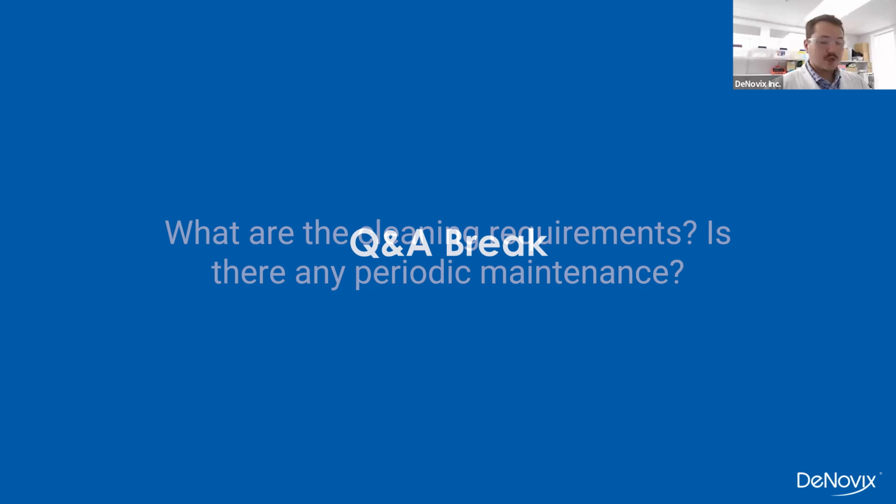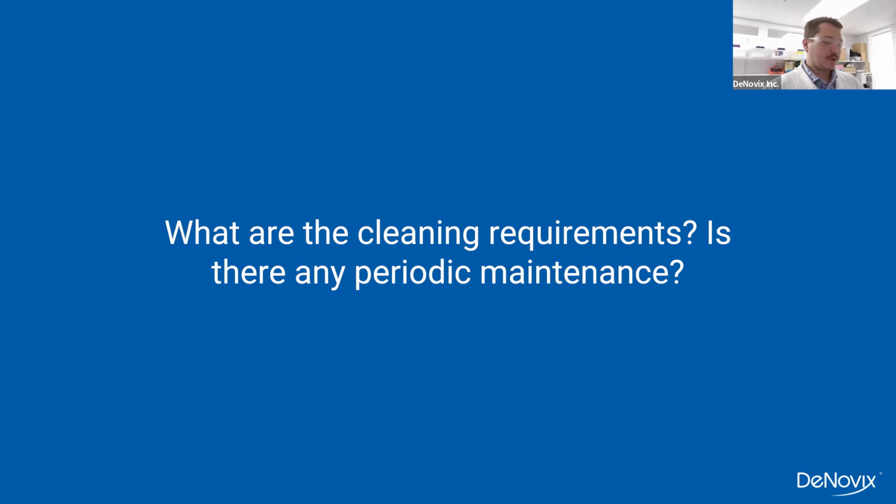That's great. I had a couple more questions on cleaning and what is the required periodic maintenance? So between samples and periodically. Yeah, this instrument's really maintenance free. As you saw between samples, I was wiping away with a Kim wipe and my sample surface was clean. If there is anything on your sample surface that's left behind by any debris or anything like that, you can pipette in any alcohol of your choice or bleach, just like you would if you were loading a sample, and just wipe away, and that sample surface will be clean.